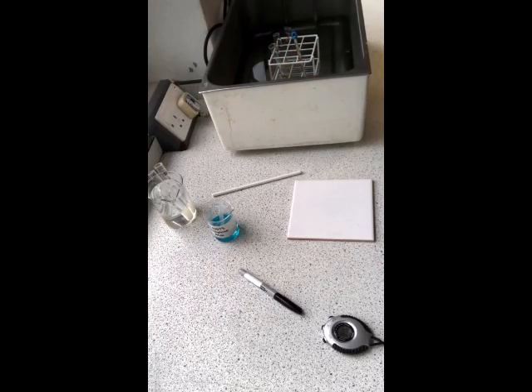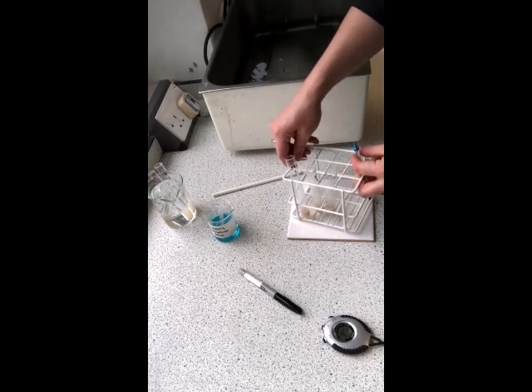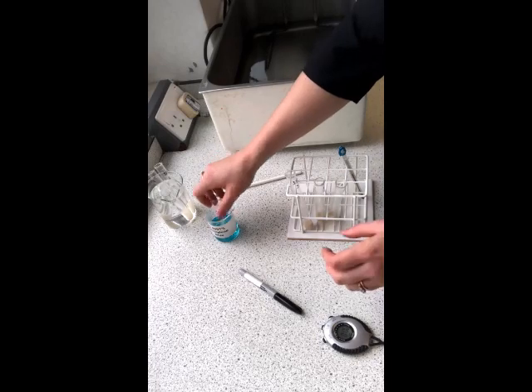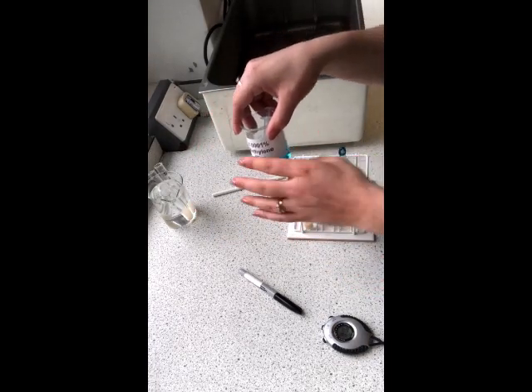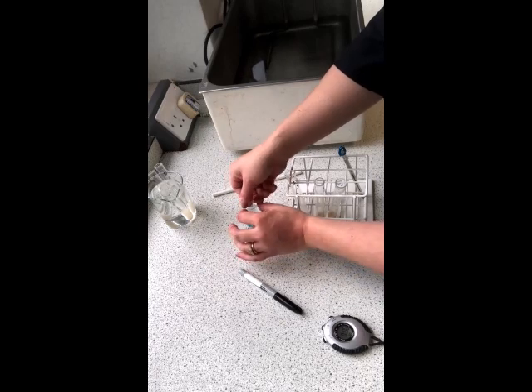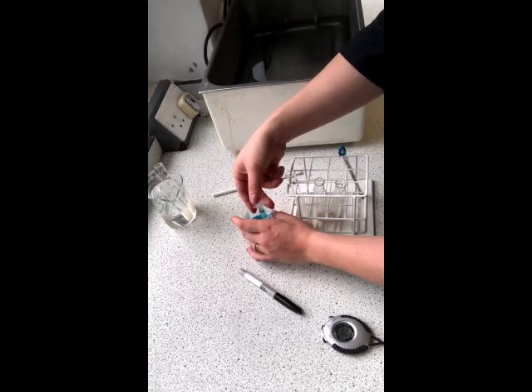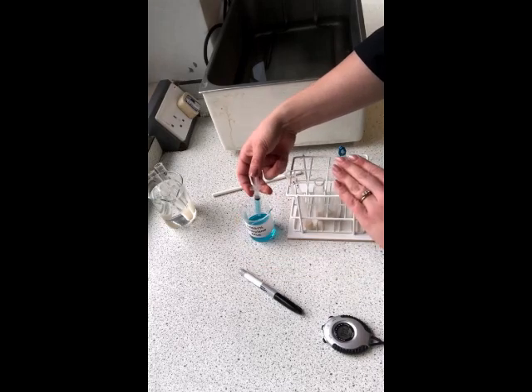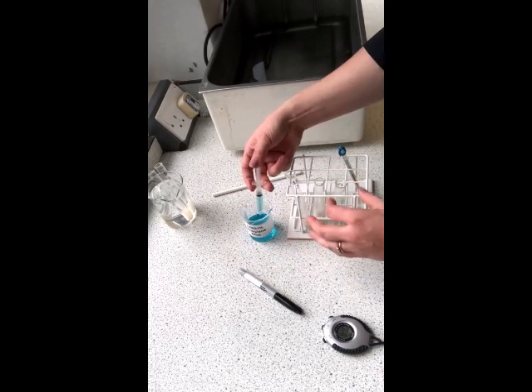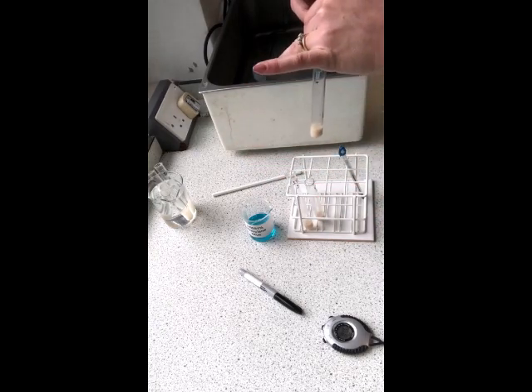So our 5 minutes have passed. This should be up to temperature. So we move on with the final step, which is again our 2 centimetres cubed of the methylene blue being added, a shake for 10 seconds, and then we will return our tube to the water bath. And we can put the other 2 in there as well, they're just going to stay at the same temperature. So tube number 1, in goes our 2.